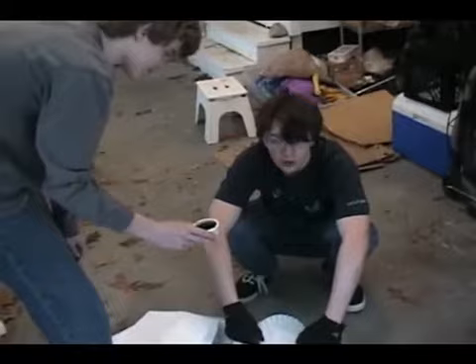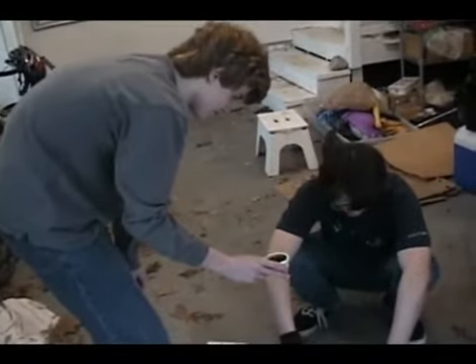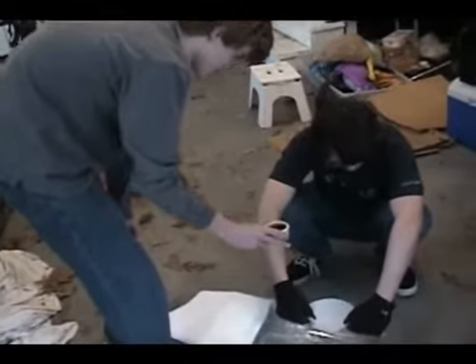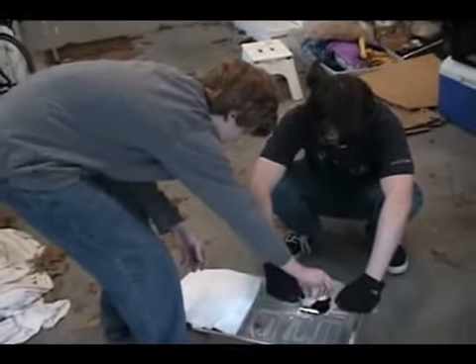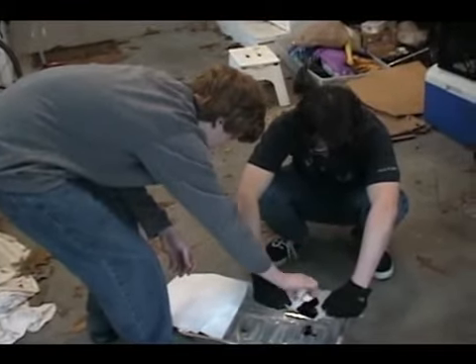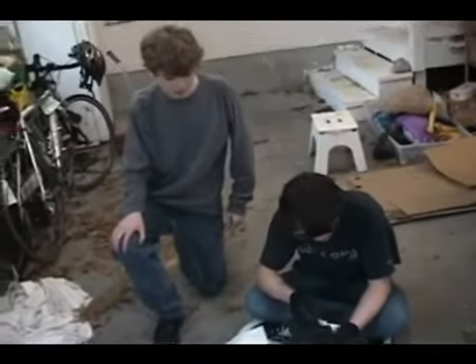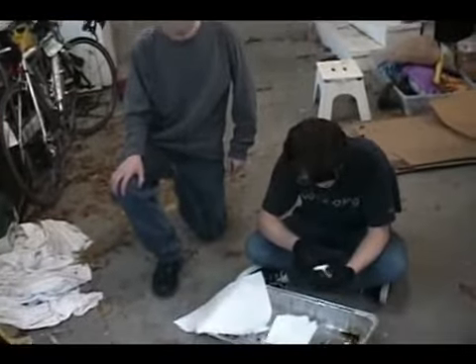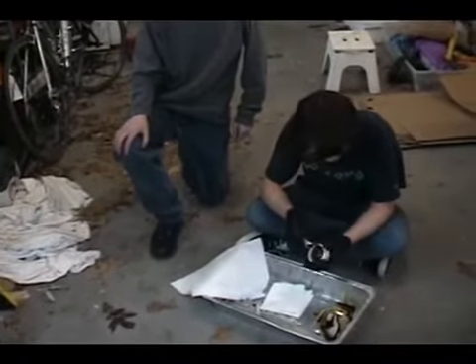We are now going to pour the nitrogen triiodide fluid, or the reactant fluid, through this filter paper. Now we're scraping out the nitrogen triiodide paste, and we're going to place it into this paper towel here, and we're going to dry it off, and hopefully we'll get something out of it.